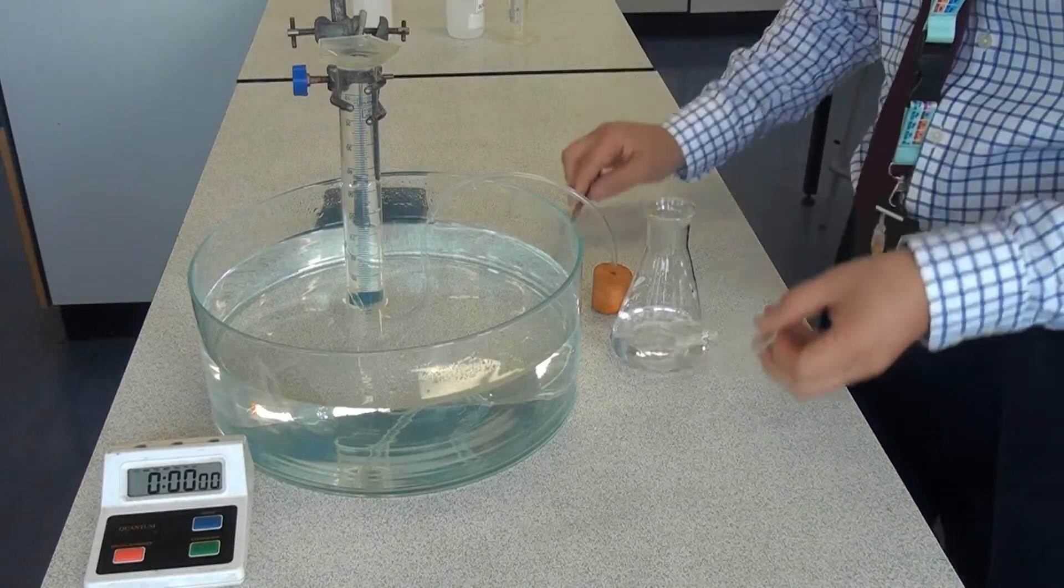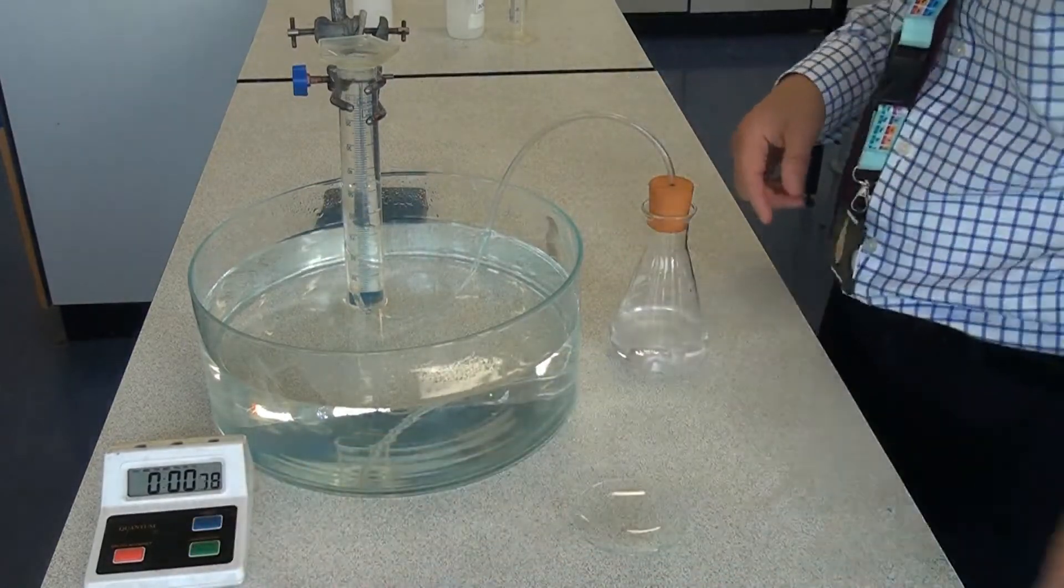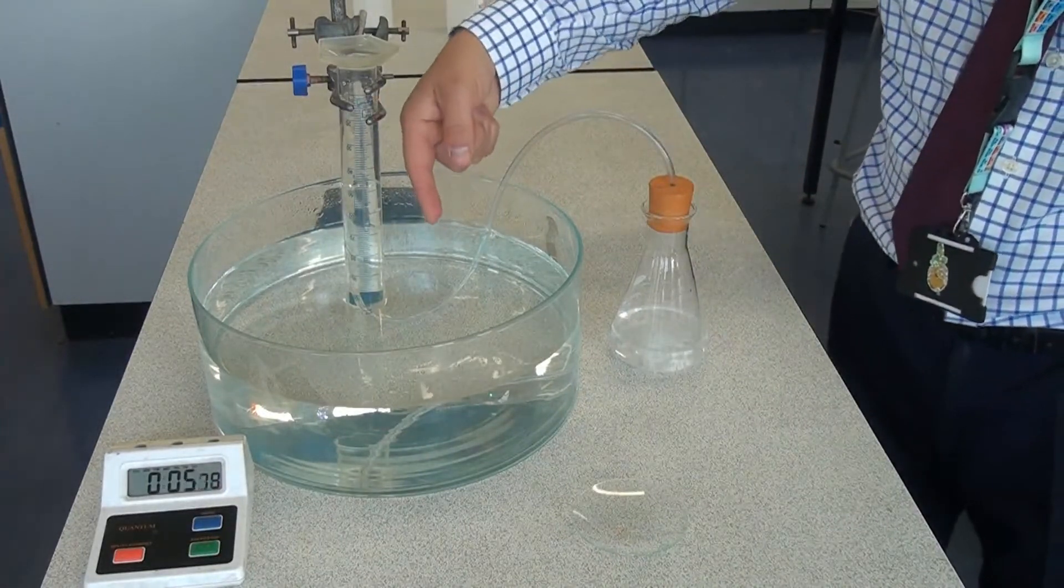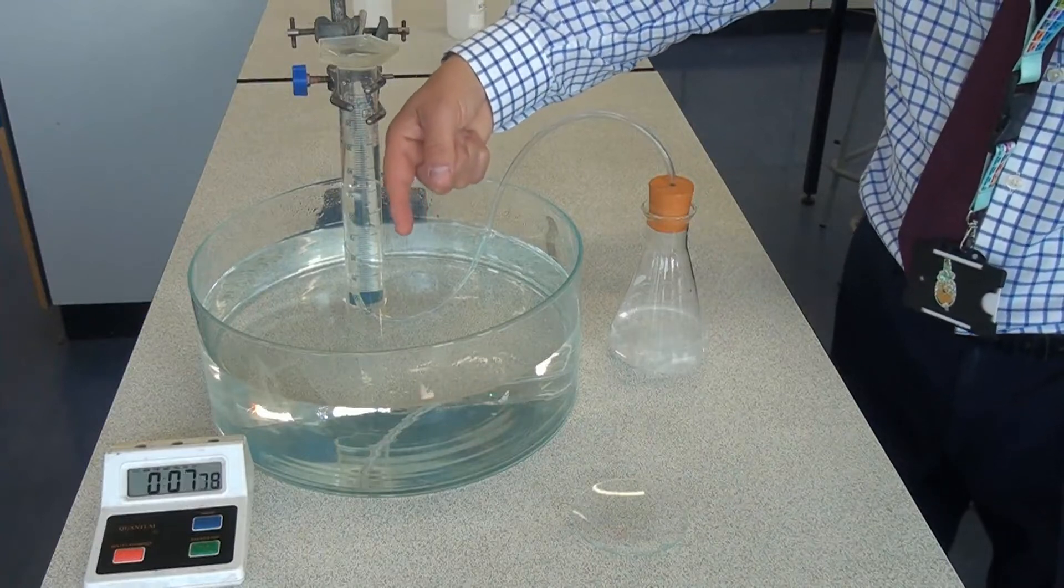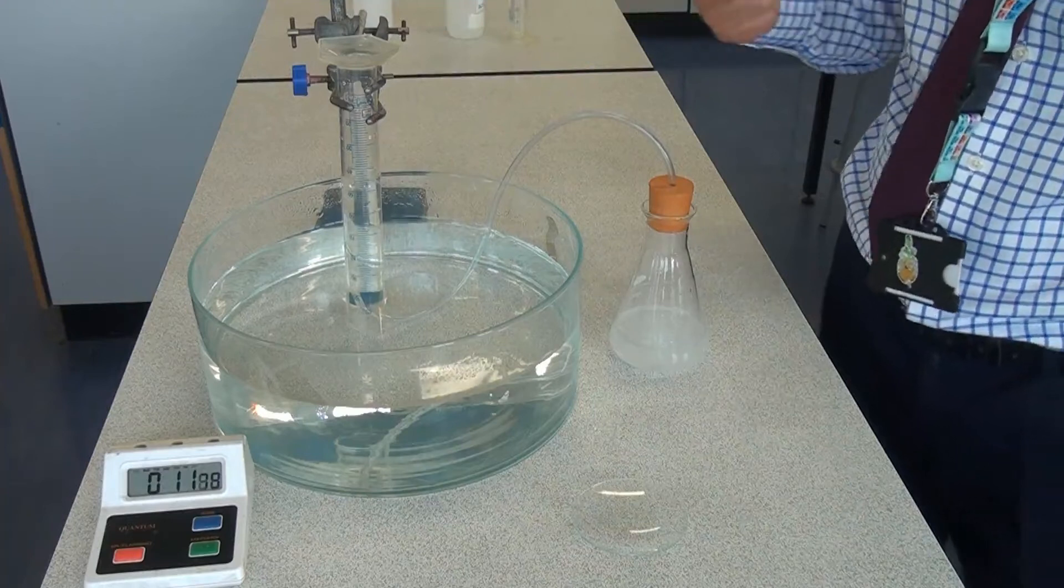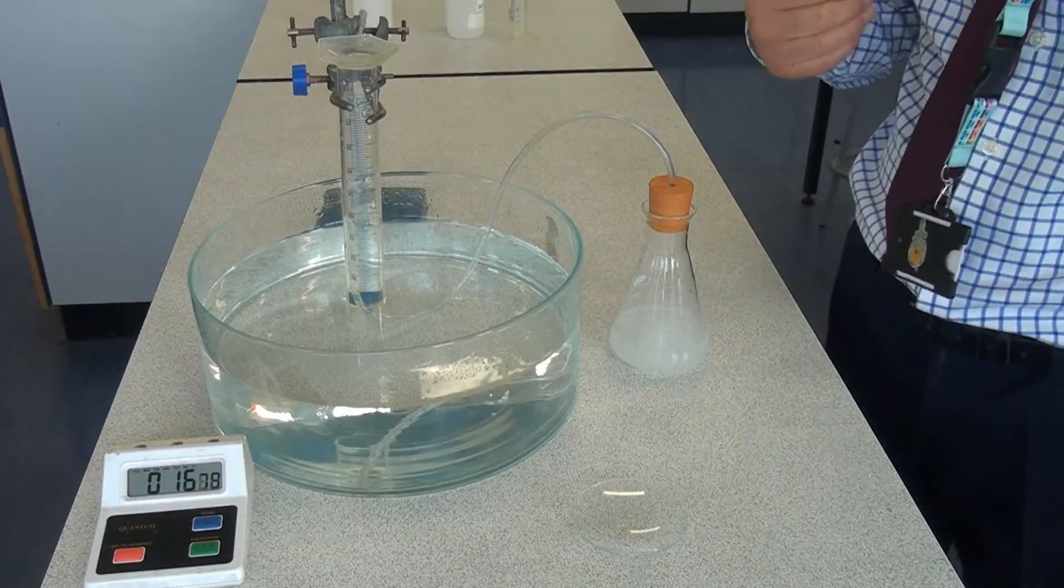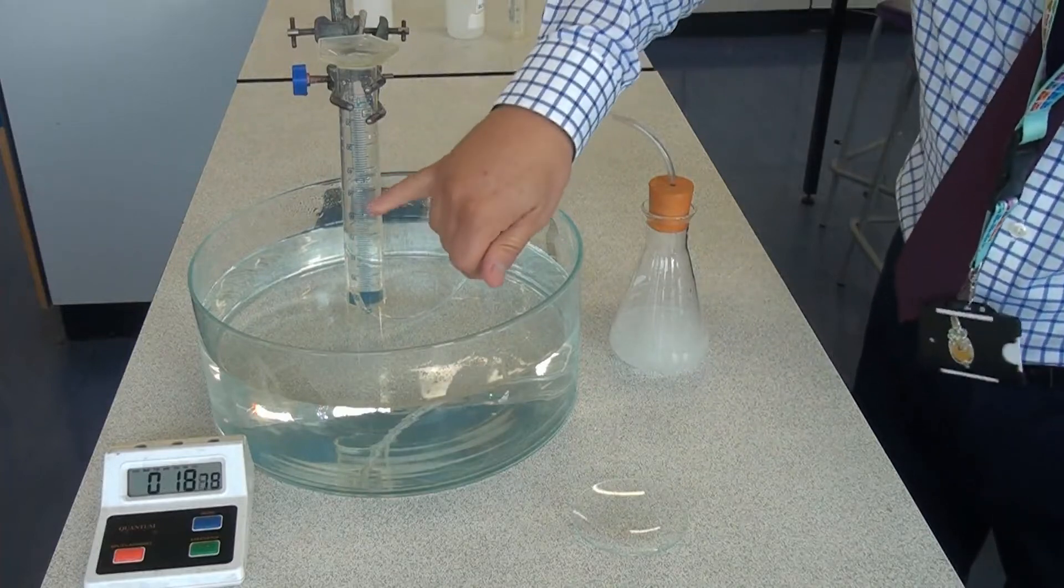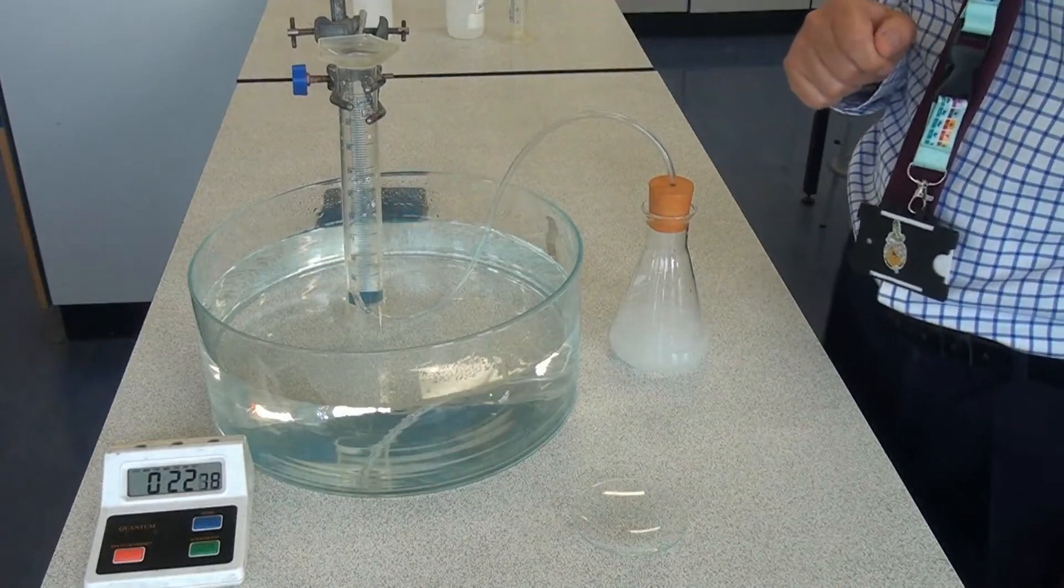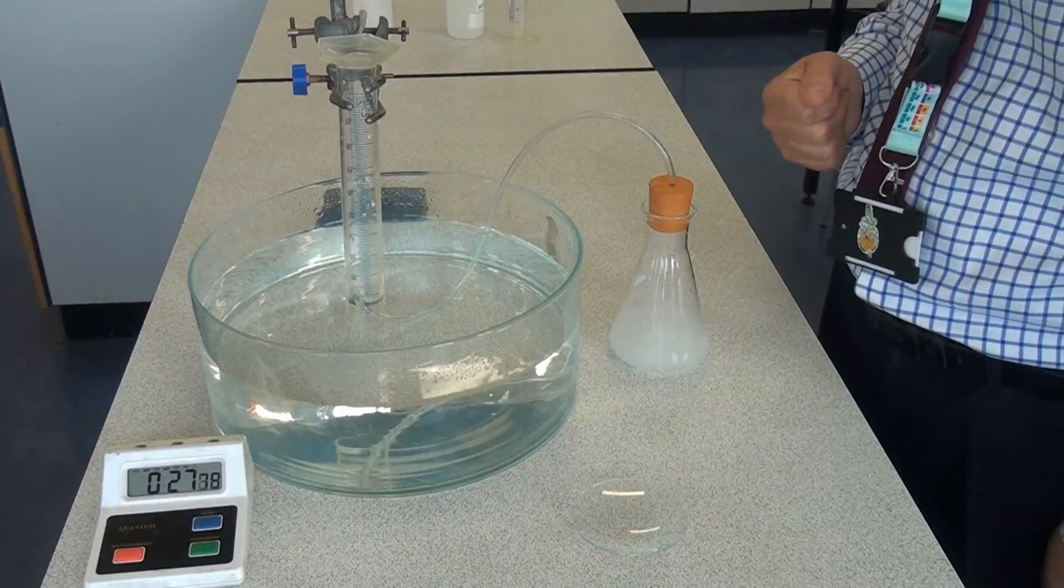So I would add the second reactant, put the bung back in, start the stopwatch straight away and as we can see, the gas has been generated, it's passing along the delivery tube and then bubbles of gas are forcing the water out of the measuring cylinder. It's displacing the water and then every 10 seconds or every 30 seconds, I would be able to read off the volume of gas that's been made by that time. Obviously, we need to do it at regular intervals, whether that's every 30 seconds or every minute.